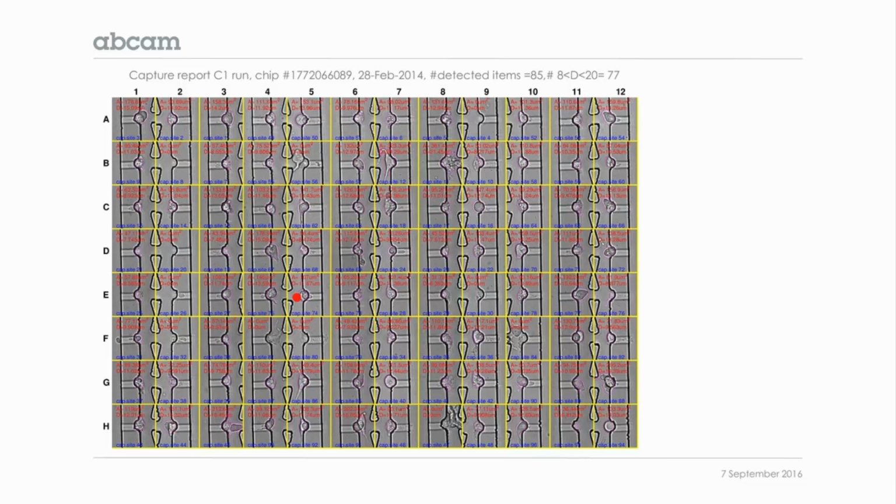So it's actually a step that in both these papers that we have presented took a lot of optimization in order to get the cells in the right state to be able to do single-cell RNA sequencing. We are working with the brain and spinal cord, which have a lot of myelin, and it's particularly difficult. So depending on your tissue of interest, it might be easier or not to do this extraction step.